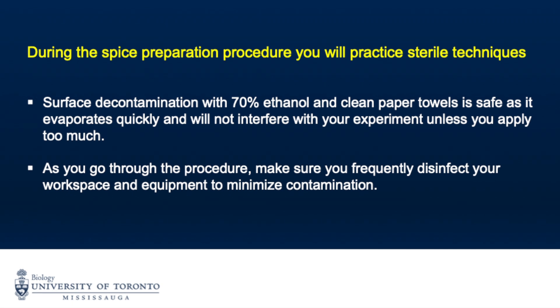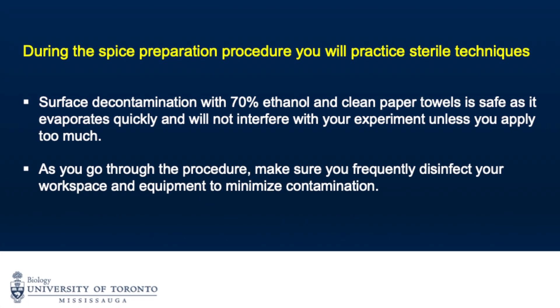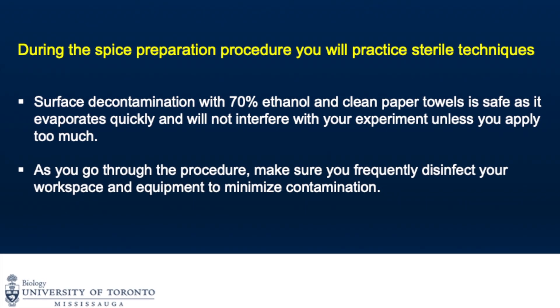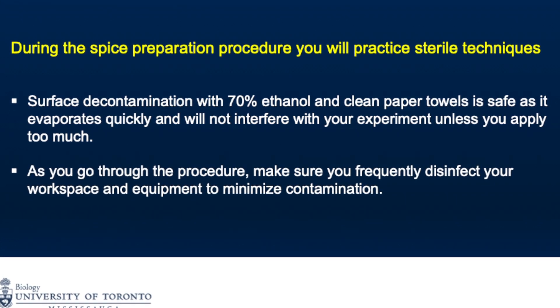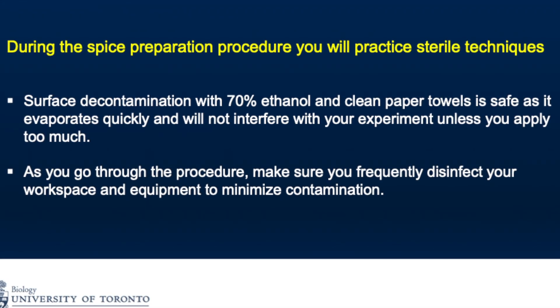During the spice preparation procedure, you will practice sterile techniques to minimize contamination in your experiment. Surface decontamination with 70% ethanol and clean paper towels is safe, as it evaporates quickly and will not interfere with your experiment unless you apply too much. As you go through the procedure, make sure you frequently disinfect your workspace and equipment to minimize contamination.